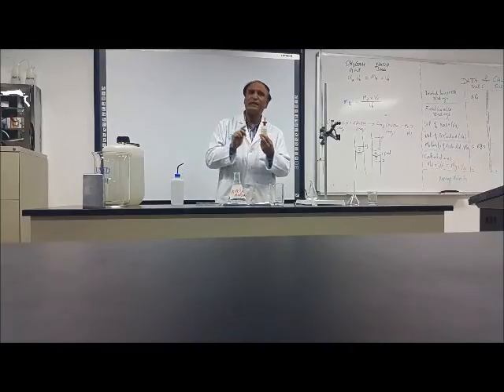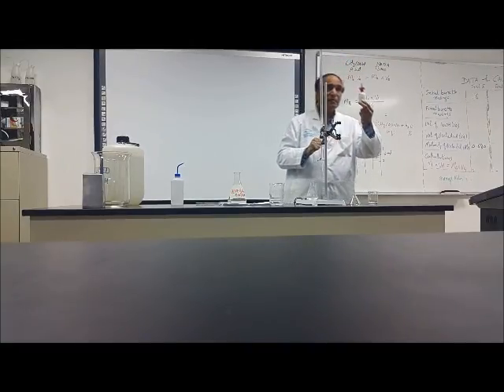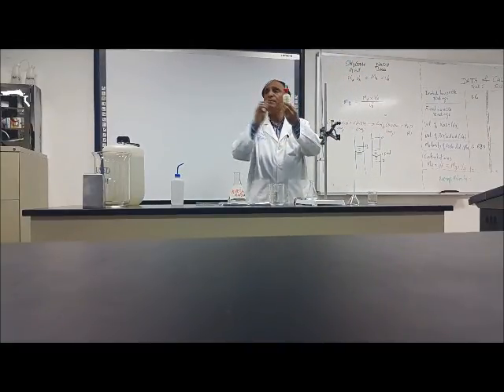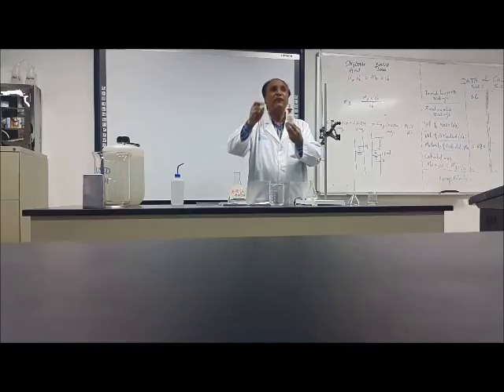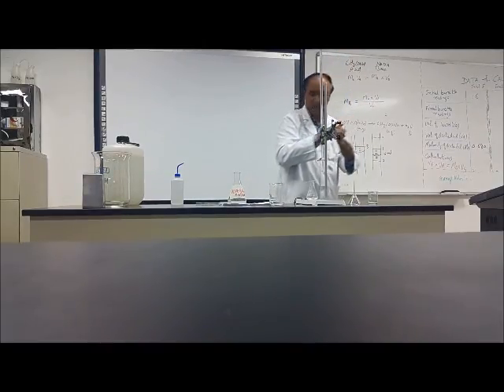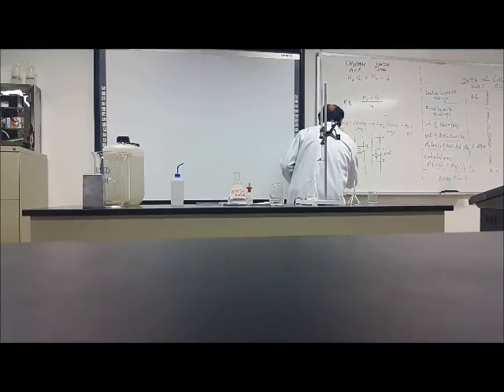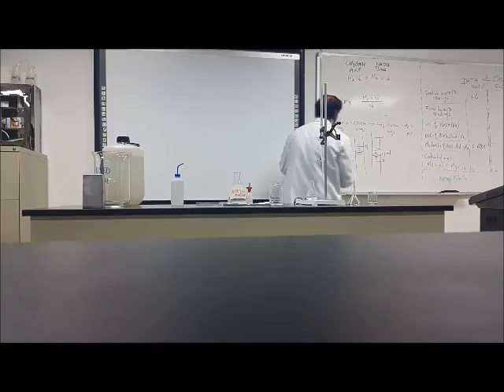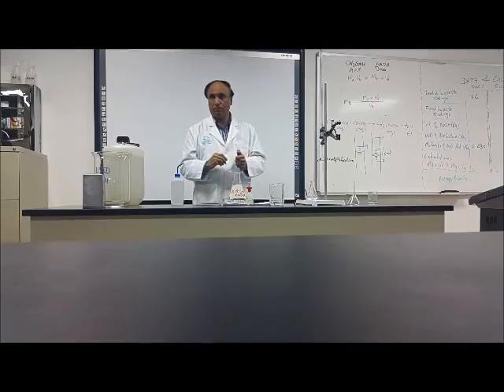So this phenolphthalein, there are so many indicators, dozens and dozens of indicators. Remember this name. It is one of the most common. Every student knows its name, every science student. So you must know it. This is phenolphthalein. Very big name. So this indicator will tell us stop. Right? Now listen to me.